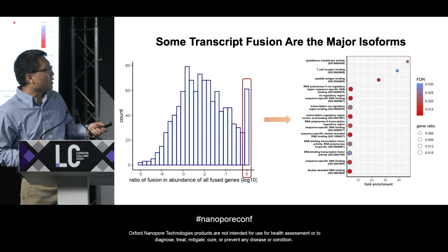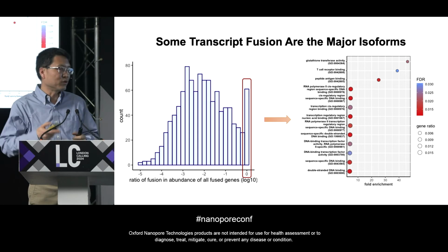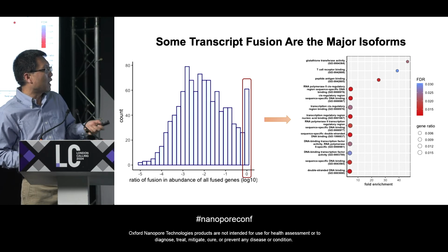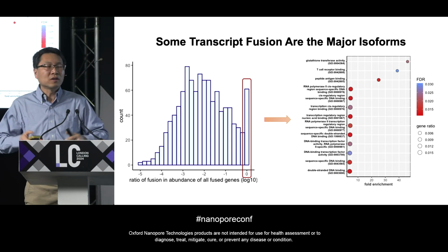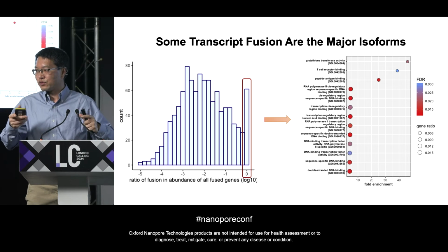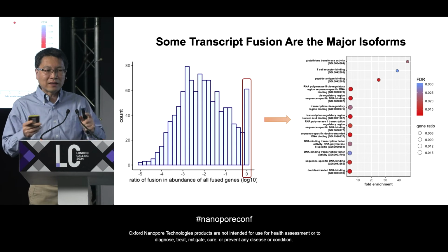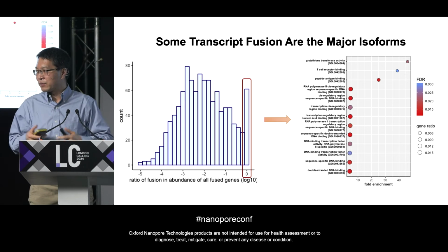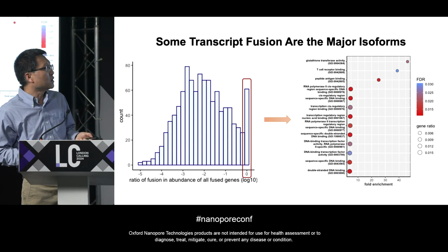A lot of them are likely biological noise, like, for example, run-on, or choosing a different UTR. But we do have small classes where the expression of that fusion gene is actually more frequent than the genes that come in as fused, the individual genes. So that suggests they are probably preferred transcript isoforms rather than just a byproduct of the unrobustness of the biological system. So what are those?